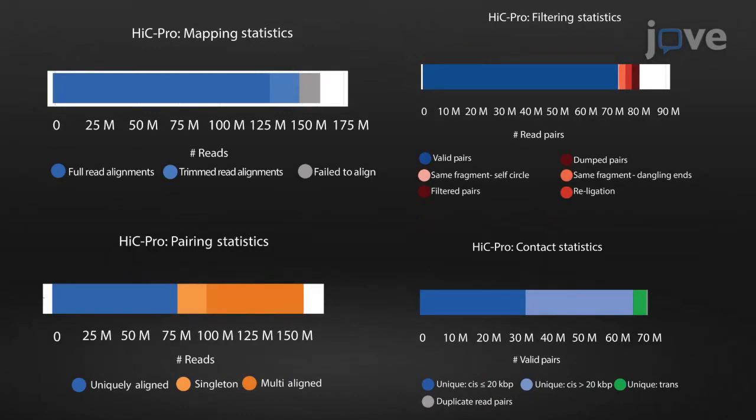Combining this protocol with genetic editing is a powerful strategy for testing the structural function of genetic elements. It can also be applied to the characterization of structural variations that lead to disease. The In-Nucleus Hi-C protocol can be applied to explore the genome organization of any eukaryotic genome.